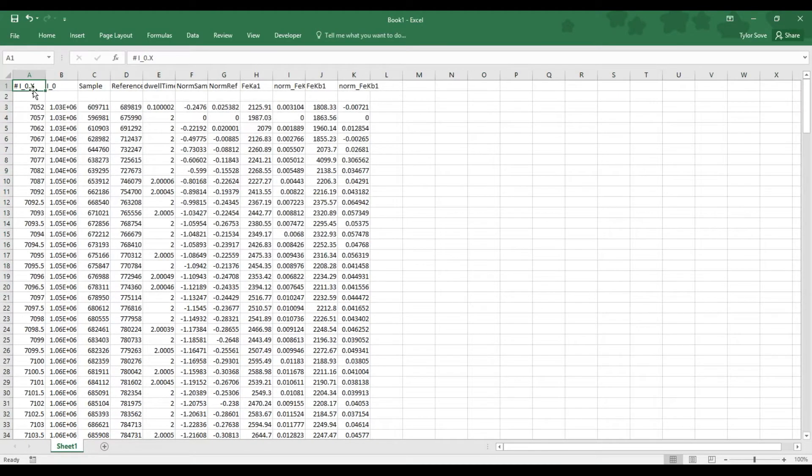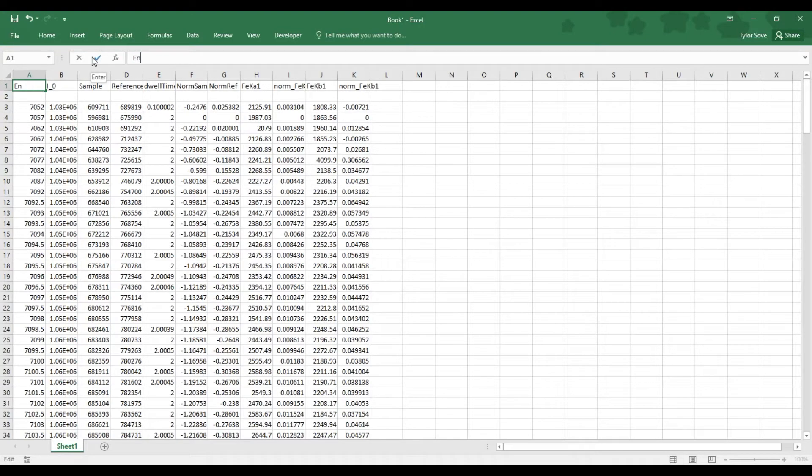What is now in cell A1, as denoted by I0X, this should be renamed to EnergyEV, as this is the energy detected by our detectors.